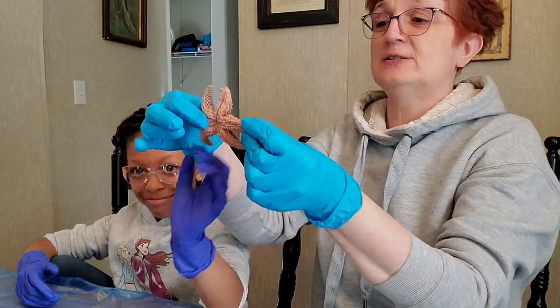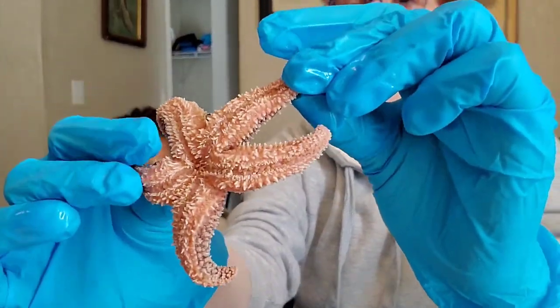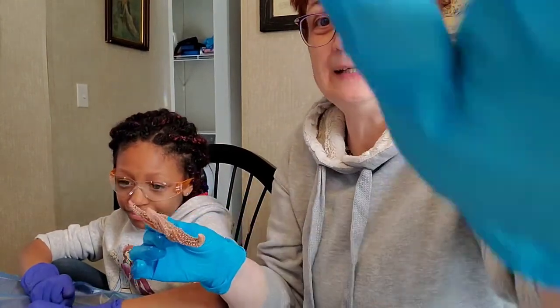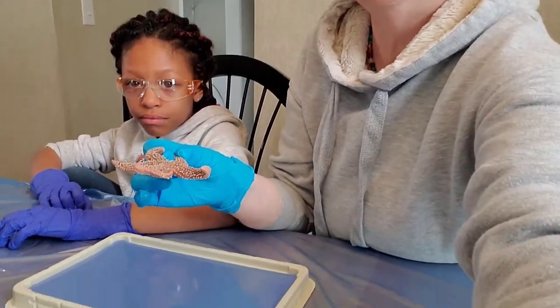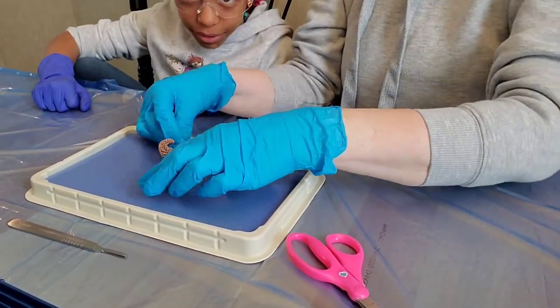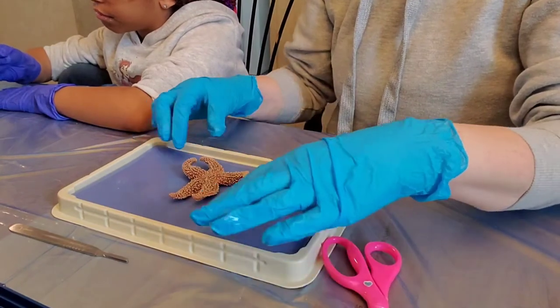Hope has the specimen — here is our starfish. It's kind of wet and cold, spiky and spiny. We're gonna lay him here on the tray and move it down a little so you all can see what we're doing — no promises! So what's the first thing we're doing?